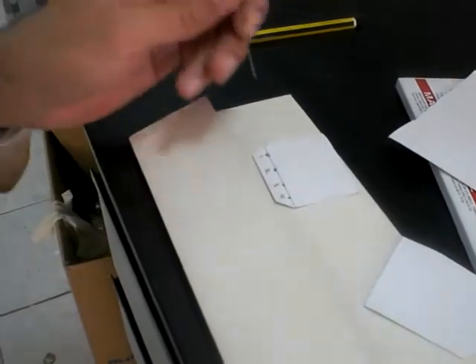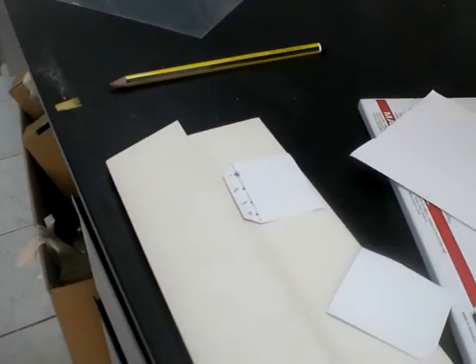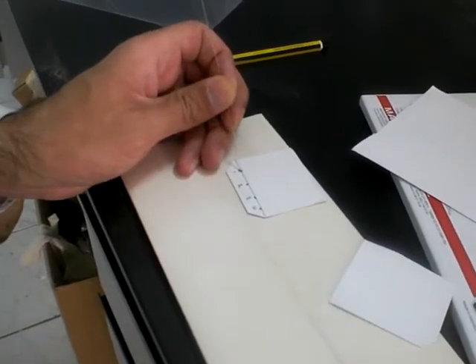It's better to use highly volatile solvents like methanol, for instance, or any other organic solvent, depending on the solubility of the material as well.